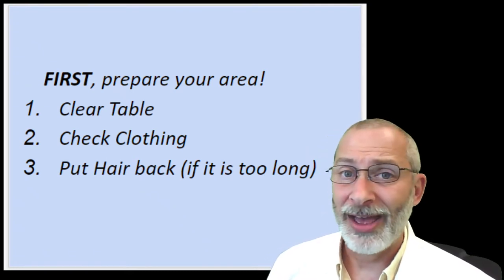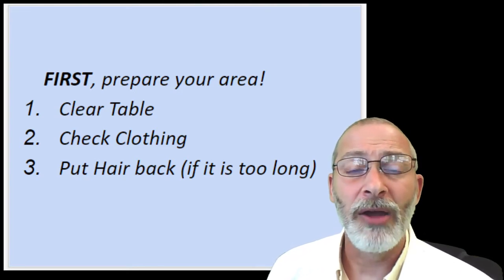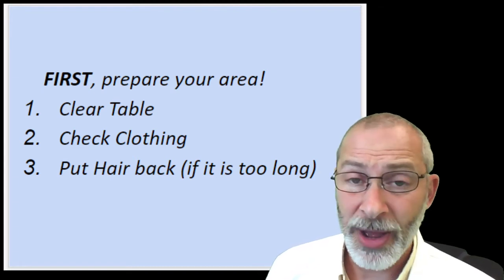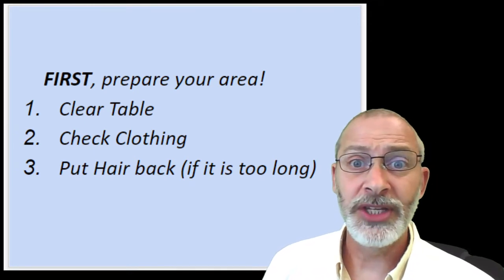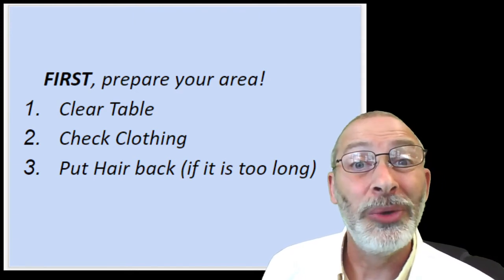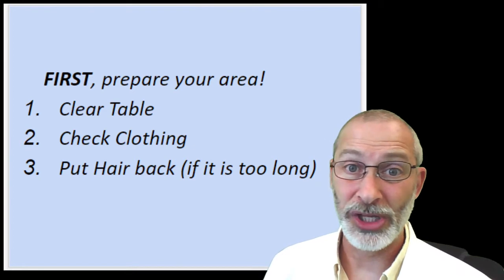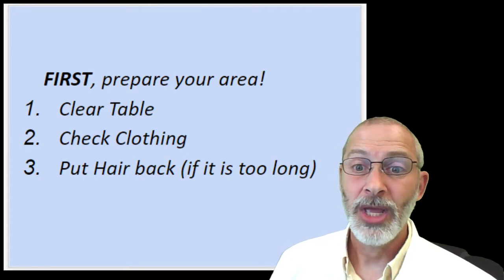I would encourage you to have hair scrunchies, hair ties, something to put your hair back. I always have an emergency supply of unused hair ties in the laboratory in case you forget one day. I have them back by the goggles, which we'll get to in a little while. But if you continuously forget hair ties of your own and you use up all of my emergency supply, well, the only thing left to tie your hair up with are elastic bands. And those of you with long hair know that that's the last thing you want to use to tie your hair back with because it gets stuck in your hair. Ouch, when it comes out. So put your hair back.